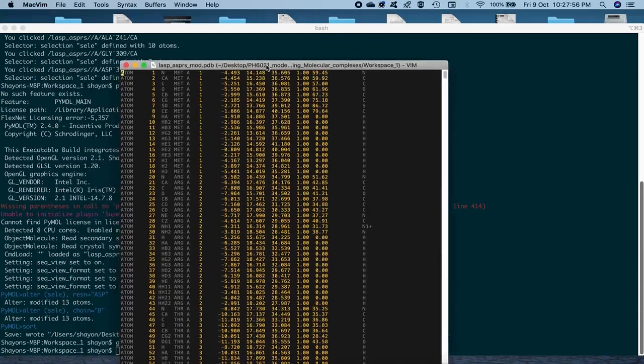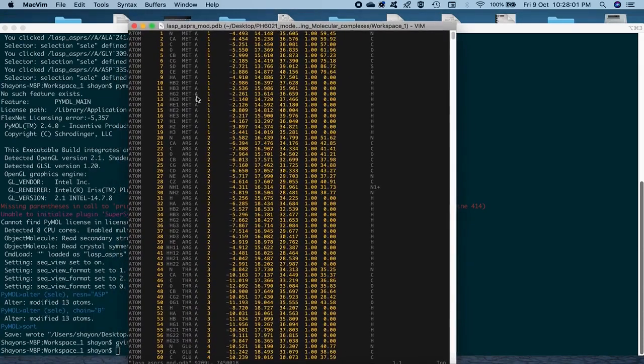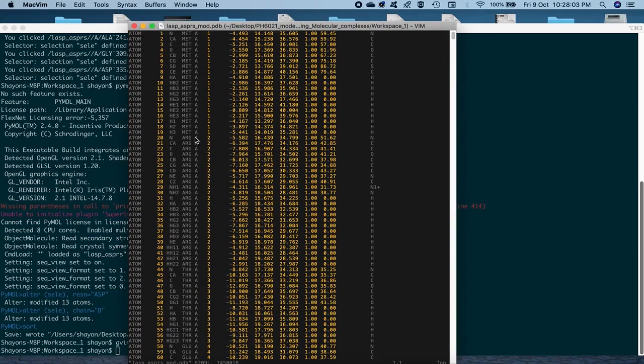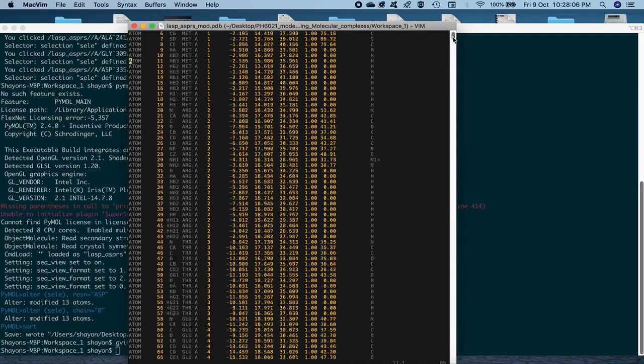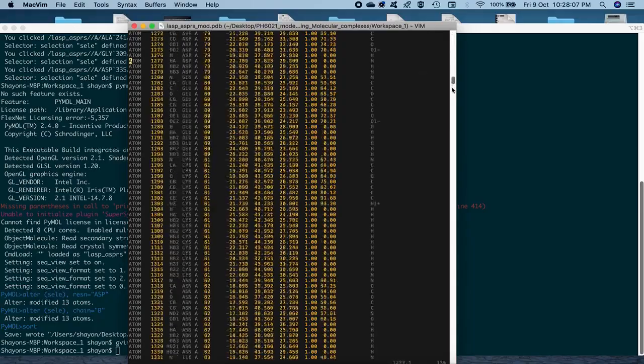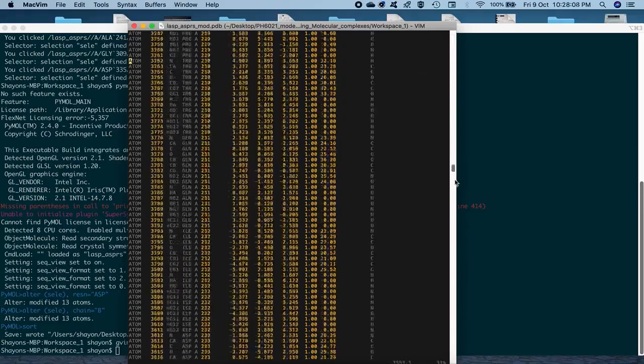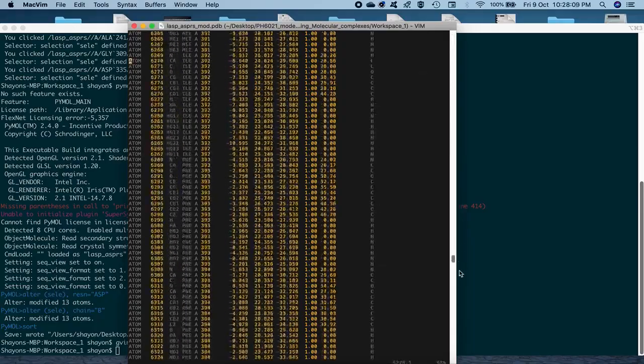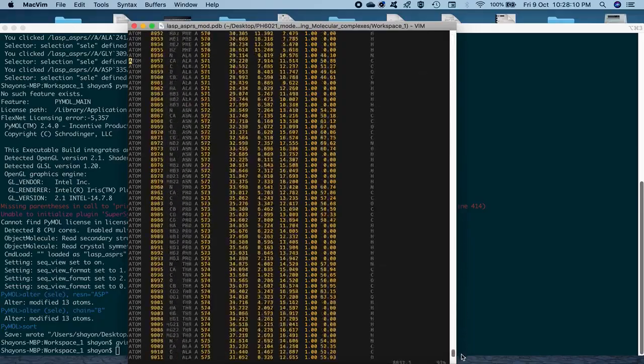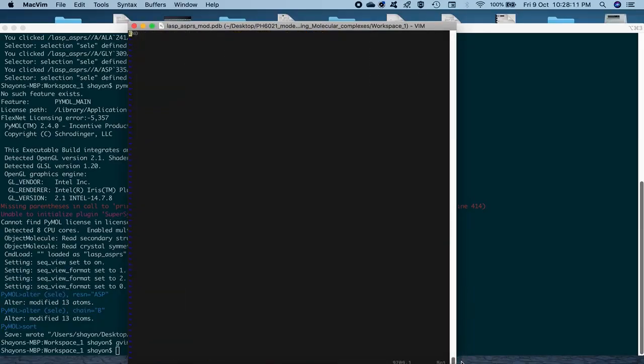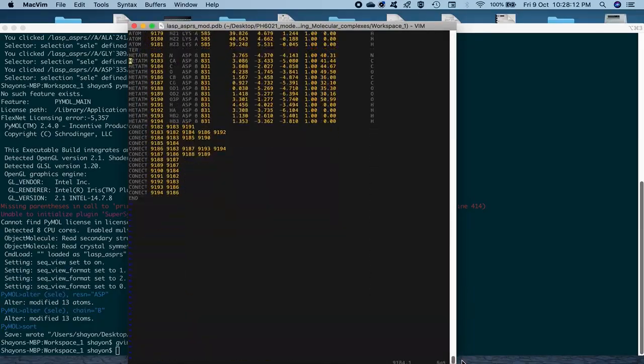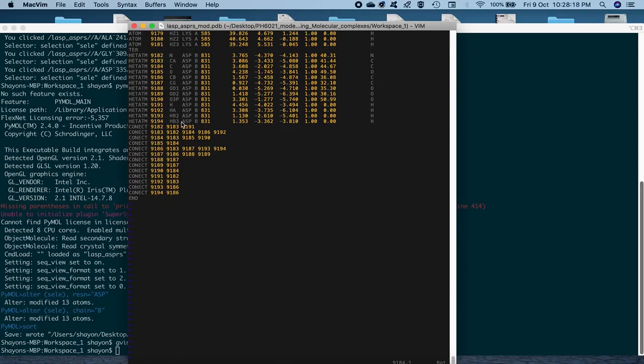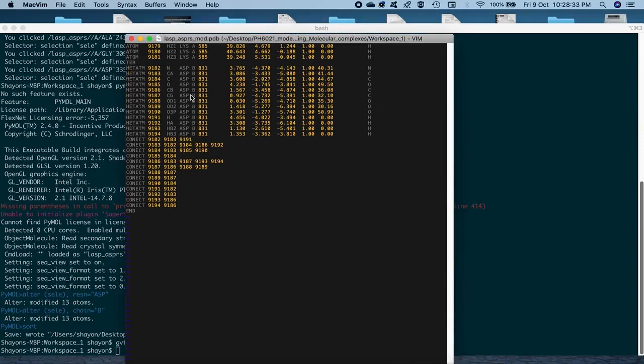So, once you open it, the chain IDs for the protein are retained as A. While, if you go further down, scroll down further to the very end where the ligand is. And you'll find here that the chain ID for the ligand, that's the ASP, that's amino acid now, is changed to B as well as the name of the residue is changed to ASP. So, we could rename the residue name and the chain ID successfully.